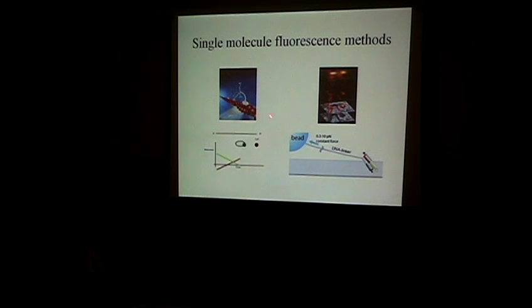The animation is not looking properly, but the third one is a couple of applications of using FRET for single molecule measurements. And finally, this is a combination of fluorescence and optical tweezers, a hybrid technique. And I have to tell you that these two are mainly done in my lab, and we also were part of this project. And this one is done by other labs that are so exciting, so I decided to show some data from their work.